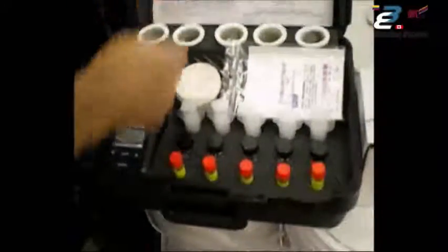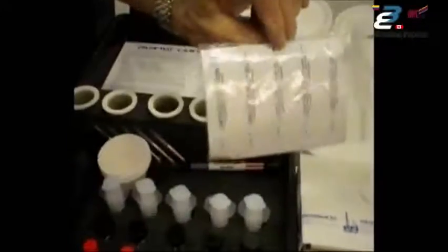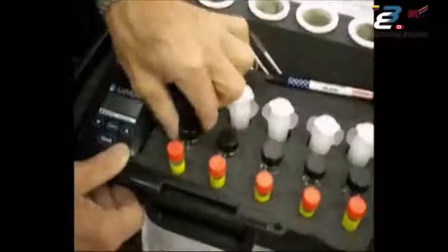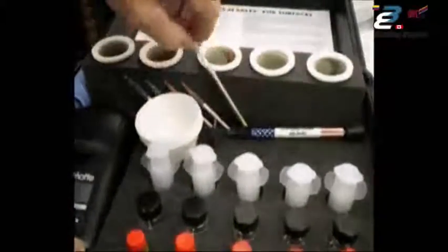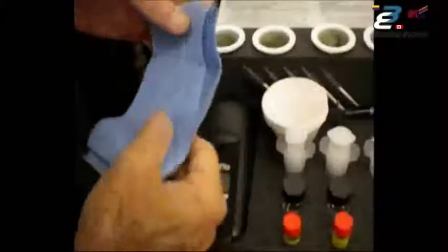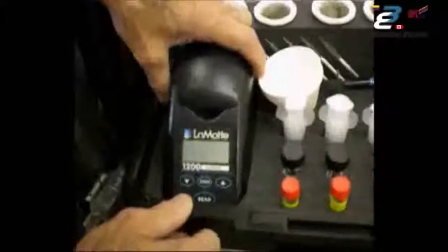The kit names the various components. This is the adhesive sleeve. This is the nitrate strip — the five little strips in there that are used to test for nitrates. This is the funnel. This is called an auto vial; it's actually just a filter. This is the bottle of chloro extract. This is the sulfate reagent. These are the titration tubes used to measure the chlorides. This is the wipes, used to keep the bottles clean. This is the meter that's used to measure the sulfates.